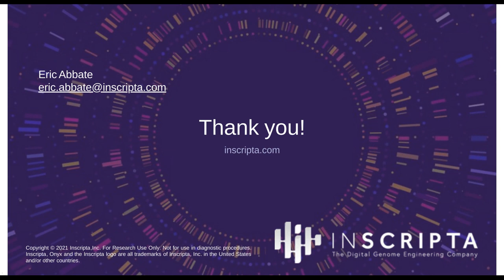So I'm not exactly sure what they're trying to ask. I assume they mean if you have a strain that you've done adaptive evolution work on, how does the process change? If that's the question, usually you have to do some sort of genome sequencing of that strain so that you can upload that into the Inscripta designer platform, or the Inscripta engineering platform, so that you can more accurately design the edits against that strain. So ideally, you want to have good sequencing information. I think that's really critical.